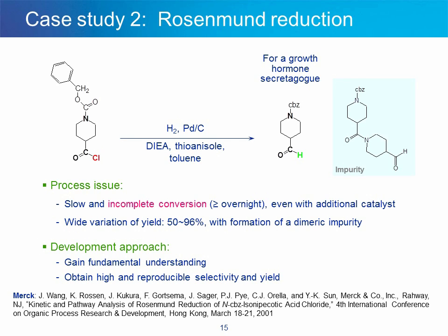This side reaction not only results in direct yield loss due to inertness of the anhydride to hydrogenation, but also imposes batch-to-batch inconsistency due to variations in the amounts of acid and water present in each batch. Moreover, the anhydride may trigger further side reactions that not only introduce additional impurities but also cause further yield loss. Conventional offline techniques are limited, particularly in detecting the anhydride.